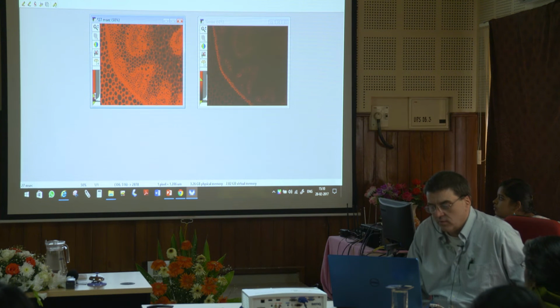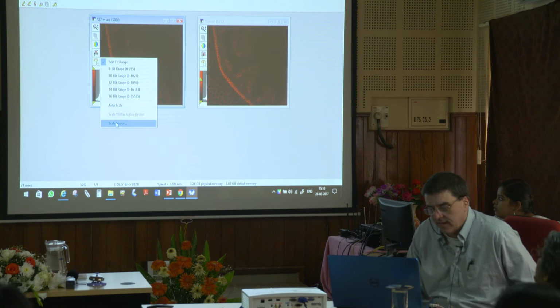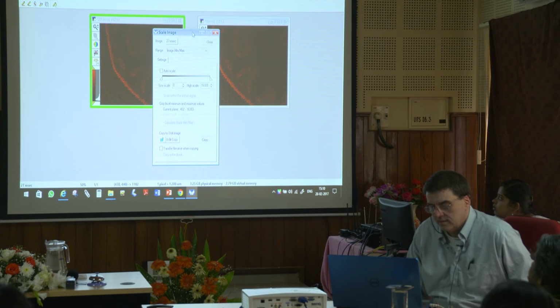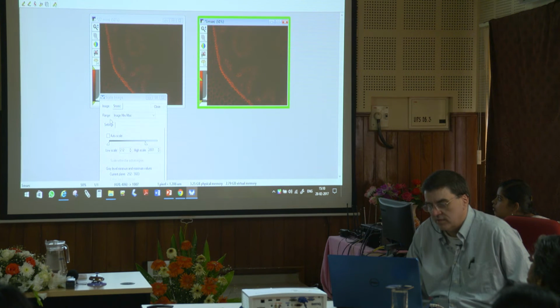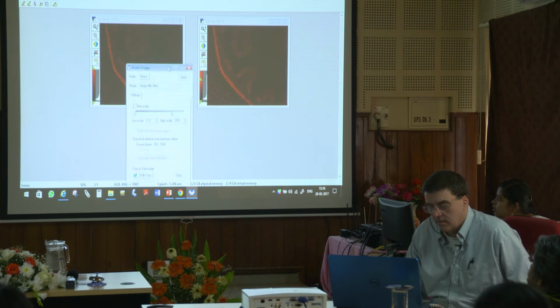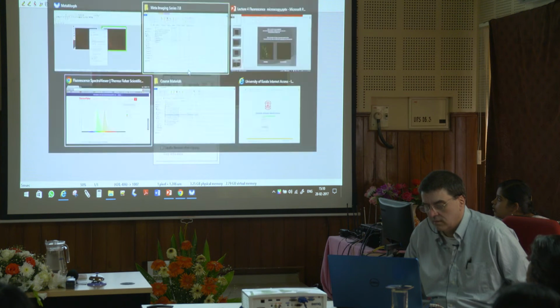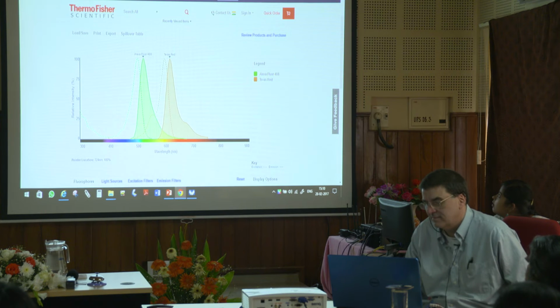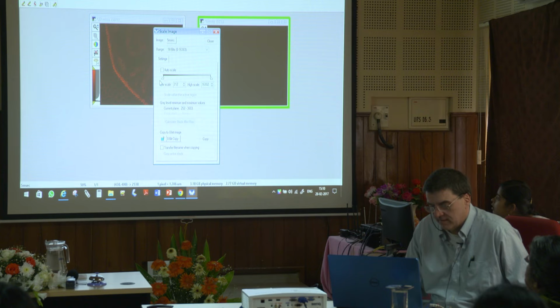So to be truthful, if I set this at 16,000, my scaling, and 0, if I did the same thing to this one, this image over here, whoops, I have to change it to 5 millisecond. 14-bit scale. Make this 0.